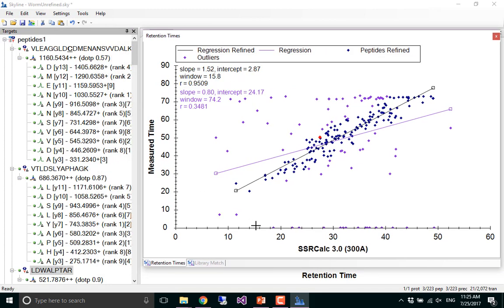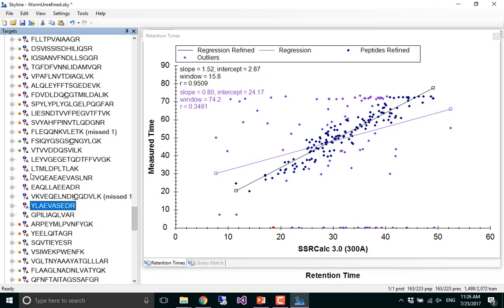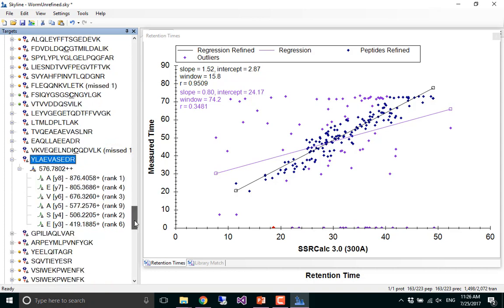Let's go click on one. So you click on it, and here we get no dot at all. That means that Skyline never saw a transition that matched any of these transitions. So for some reason, there's no record of any kind of measurement of these things. And boy, that was confusing to me when I started with it. I used a debugger and looked at the Skyline code and at the values. But every time I do that, I try hard to think about how a normal Skyline user could figure out what I've just learned.